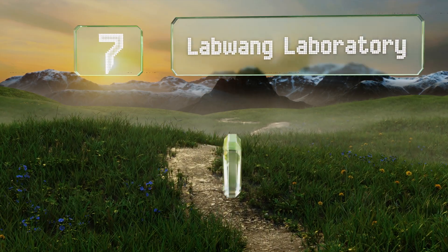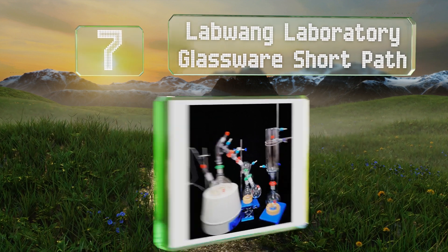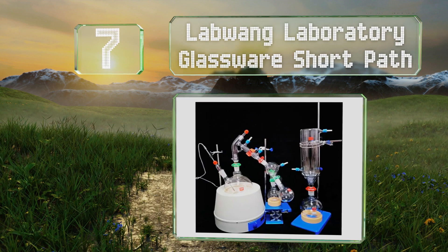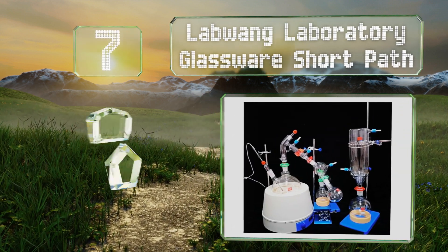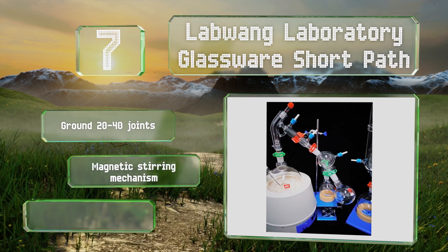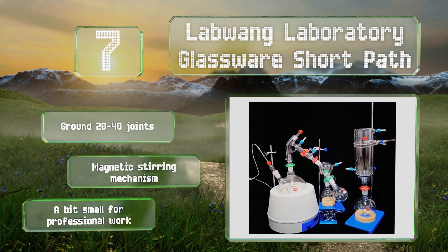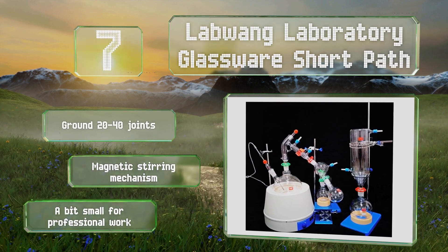At number seven, the Labwang Laboratory Glassware Short Path comes with an adjustable stage to support the triple cow attachment. Its mantle makes it a cinch to set experiments to exactly the right temperature to help reduce the risk of error. It's equipped with ground 24/40 joints and a magnetic stirring mechanism, but it's a bit small for professional work.